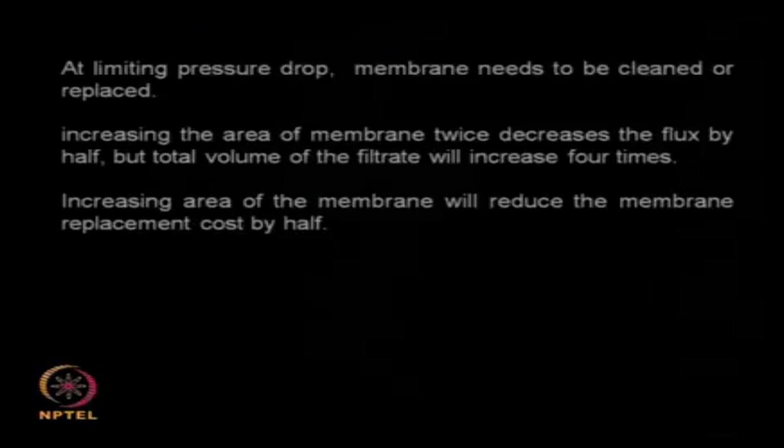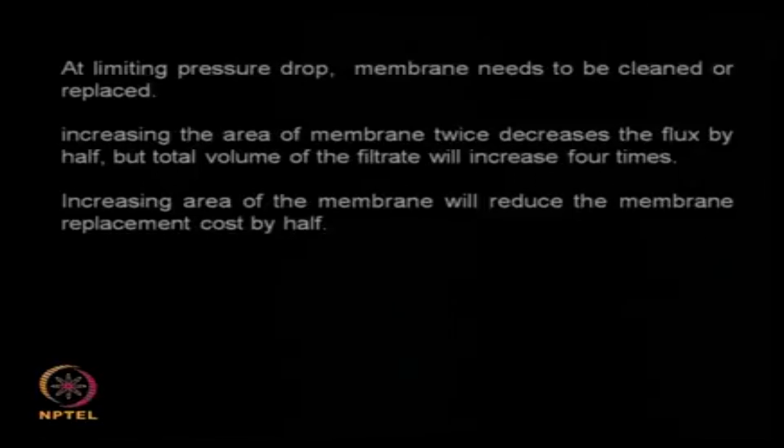So that all depends upon what is the product you are manufacturing, what is the fermentation that is taking place, what is the fermentation time, and so on. So if your fermentation broth can be stored in an intermediate tank, and then you can do a filtration in a membrane process, so that your fermenter is not disturbed when you stop and start your membrane filtration, then you may be able to afford to have a smaller membrane unit with lower surface area.